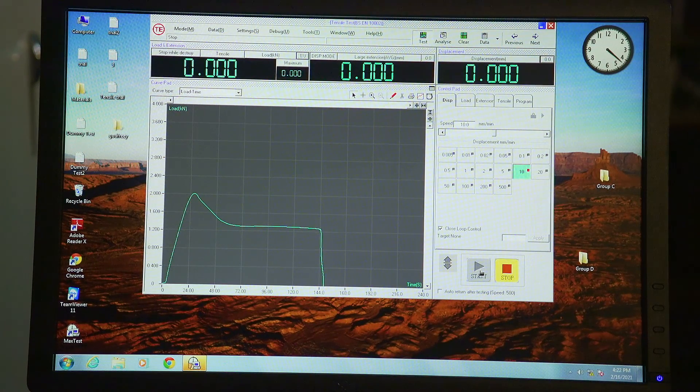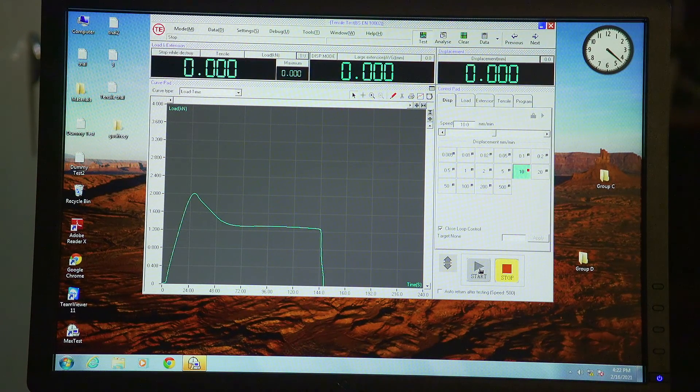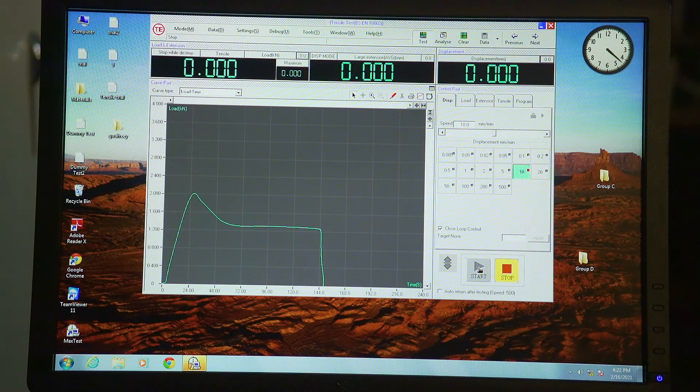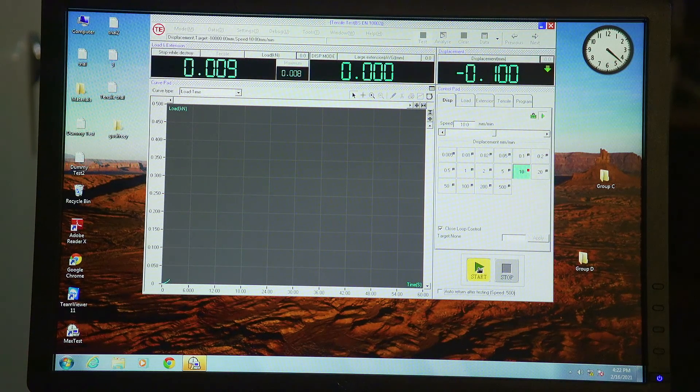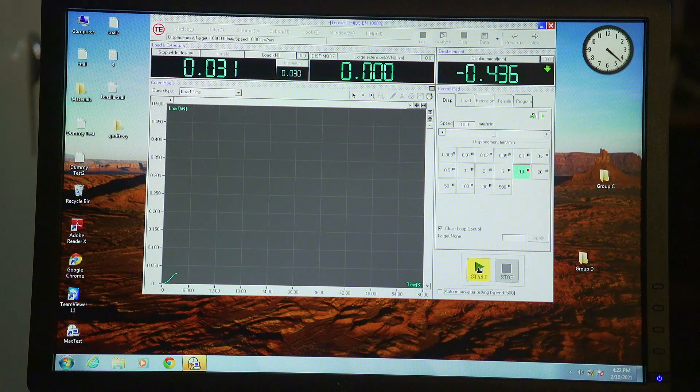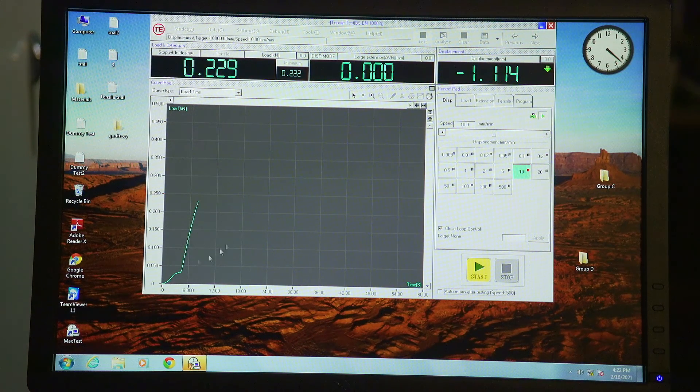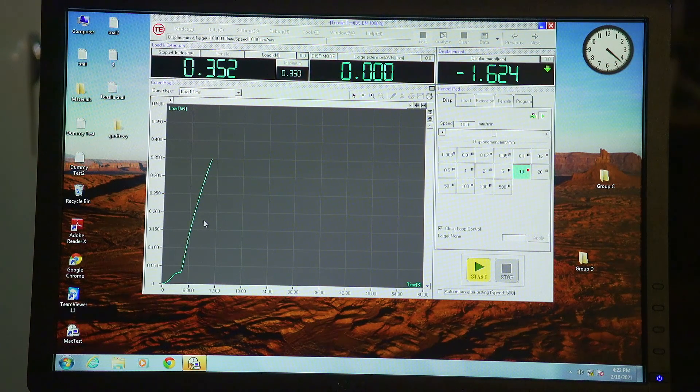I will now start the test on the HDPE sample to show you the difference in behavior between the HDPE and the PVC. As you can see, similar to the PVC, the HDPE also exhibits a linear behavior at the beginning of the test.